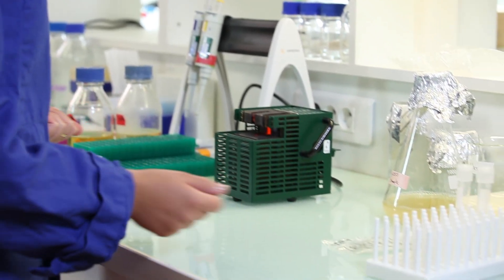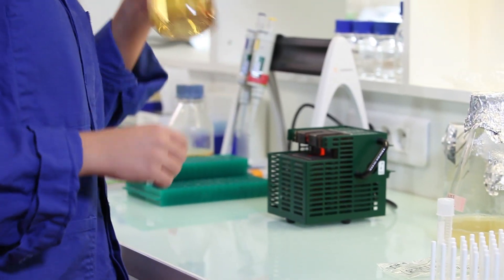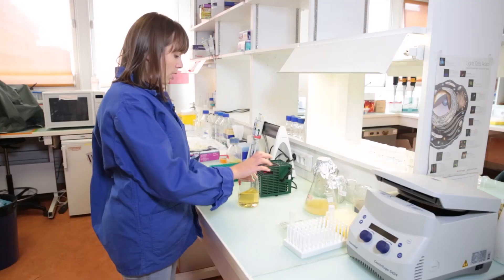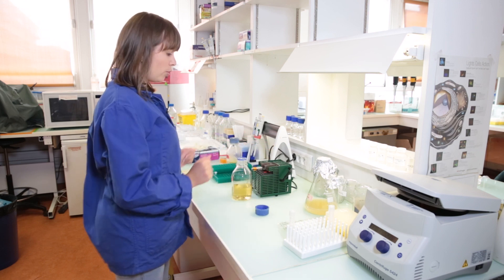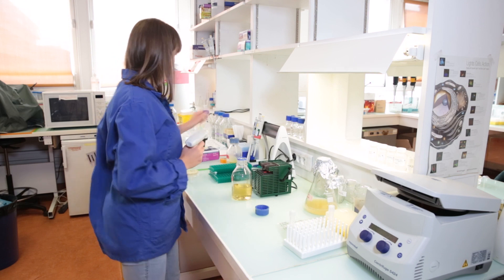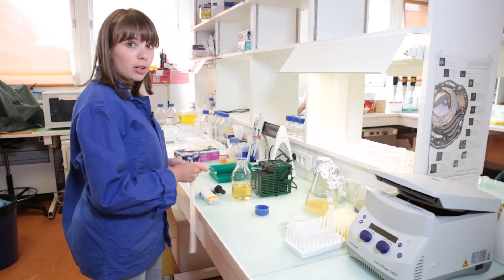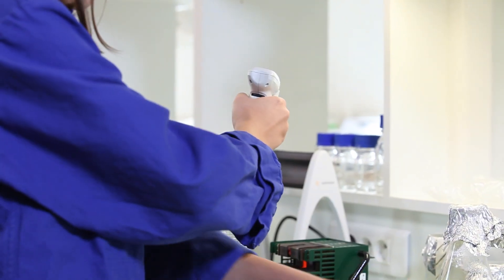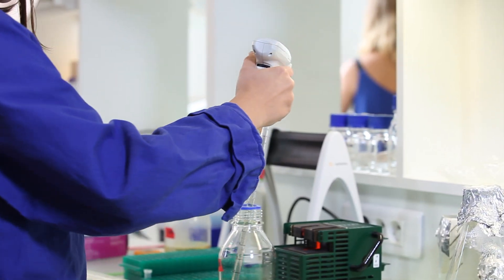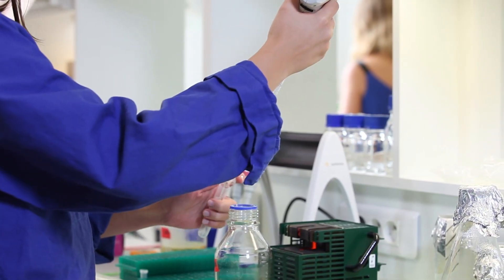So to start, you have to start a bacterial culture. For this we need a culture tube and some media. To keep it sterile we will be working around a source of heat, and I will now pour some media into the cell culture tube. About 5 ml is enough.